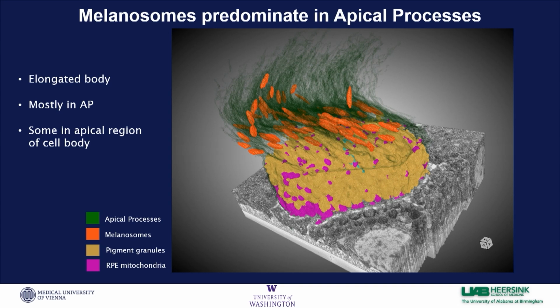One thing I was really interested in, going further down the cell, was the nucleus, which you can see here slightly peeking out in turquoise, and we were able to really nicely see the nuclear pores in our EM volume. As an extracurricular activity in my off time, I decided to mess around with Dragonfly and experiment with some of these nuclear pores to see if I could get a model to correctly label them. It worked quite well, and I took a volume and let it segment overnight.